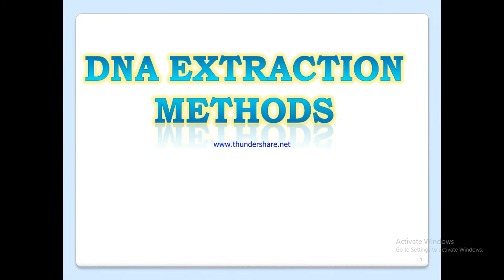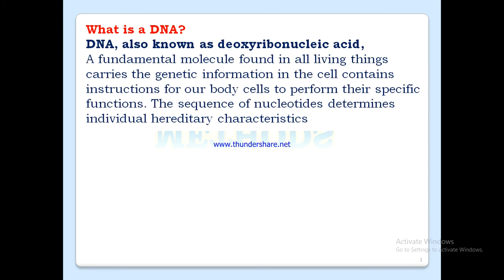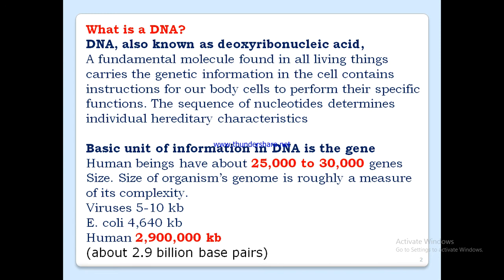DNA extraction methods. What is DNA? DNA, also known as deoxyribonucleic acid, is a fundamental molecule found in all living things. It carries the genetic information in the cell and contains instructions for our body cells to perform their specific functions. The sequence of nucleotides determines individual hereditary characteristics.